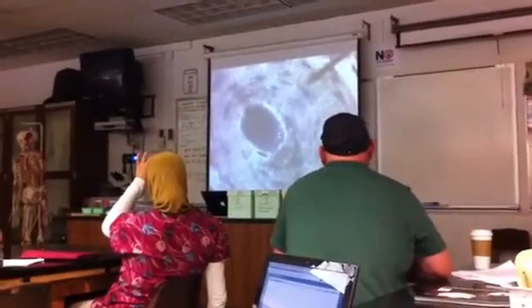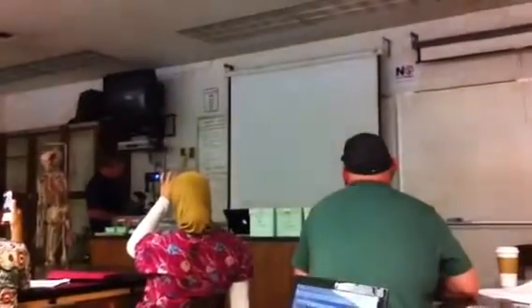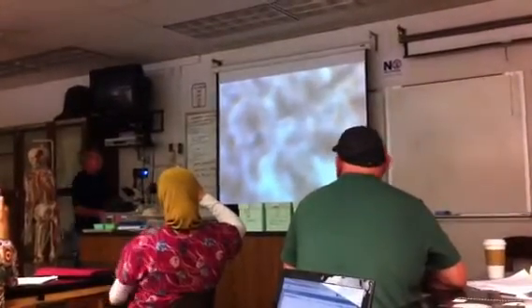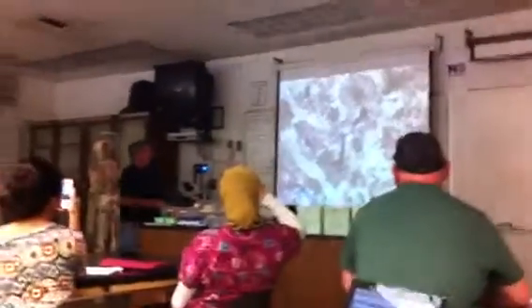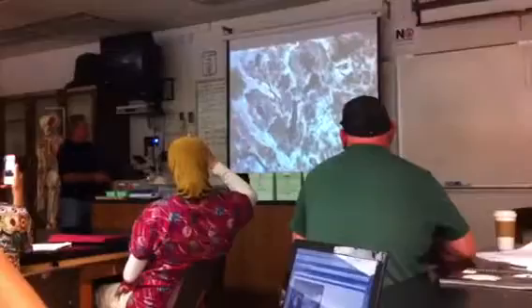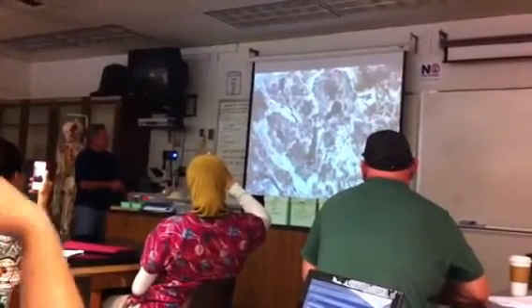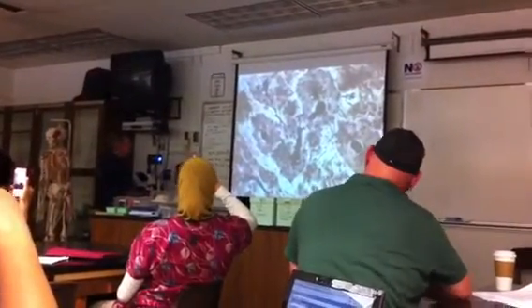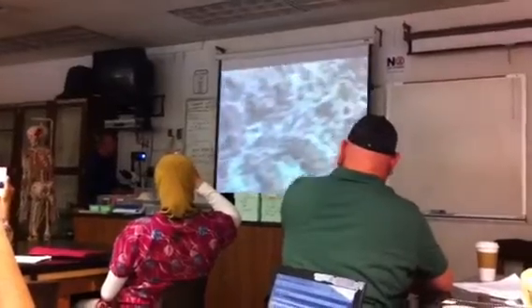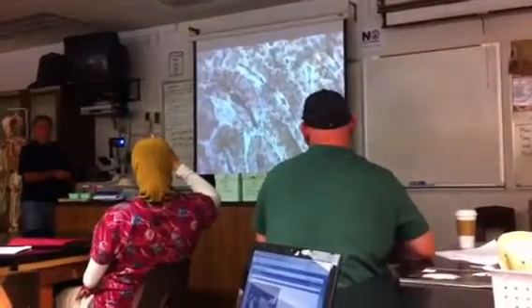The only other thing on this slide that I want to point out to you, and I think I'll go back a power for that, is the perforating canal, or the Volkmann's canals, which are the same thing. And here's actually one right here. They tend to show up as thick black lines. It looks like it might be a little broken right there, but it was going from here to here. There's another one right here. So those are the perforating canals.